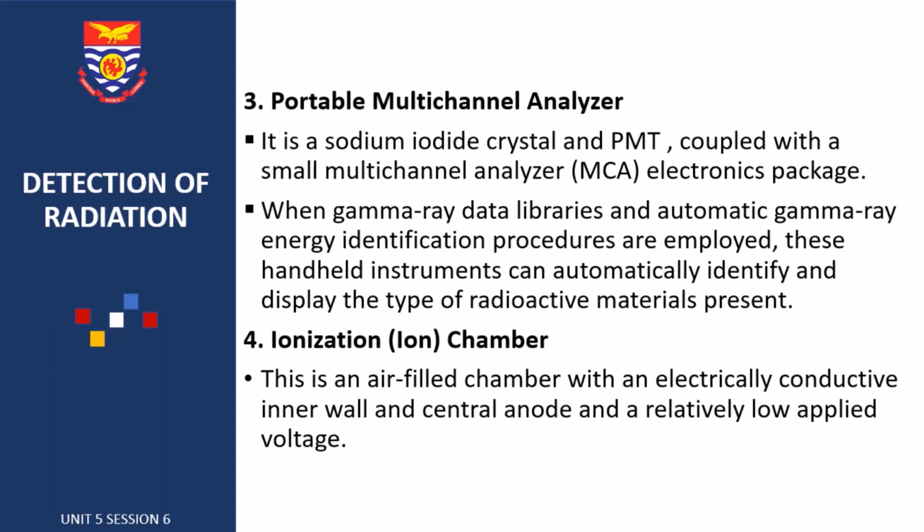The fourth instrument that we shall be looking at is the ionization chamber. The ionization chamber is an air-filled chamber with an electrically conductive inner wall and central anode and a relatively low applied voltage. We shall delve more into the ionization chamber as we move on.